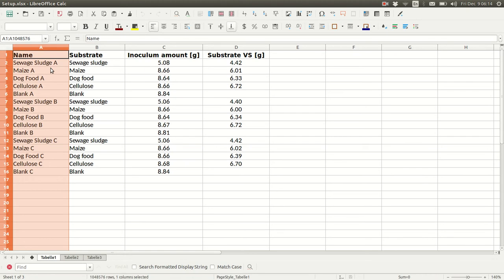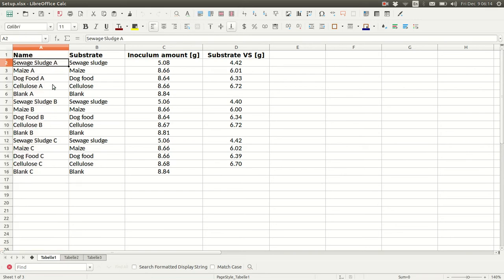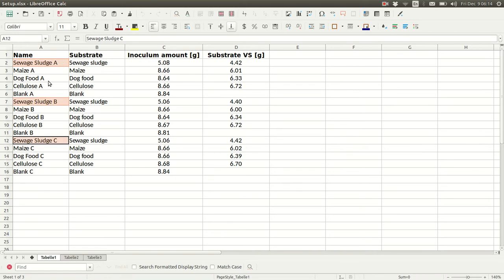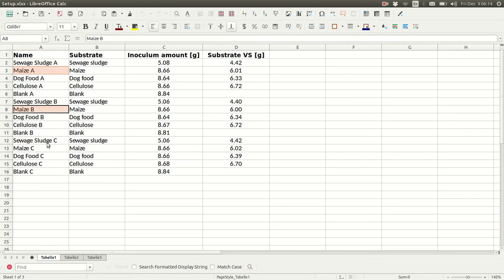Name is used to match these rows with the columns in the biogas file. First thing we need is info on how the bottles should be grouped. Here, all these sewage sludge bottles are grouped together and called sewage sludge. And something similar for maize, dog food, and cellulose. We have a total of four substrates here. And the blanks as well.